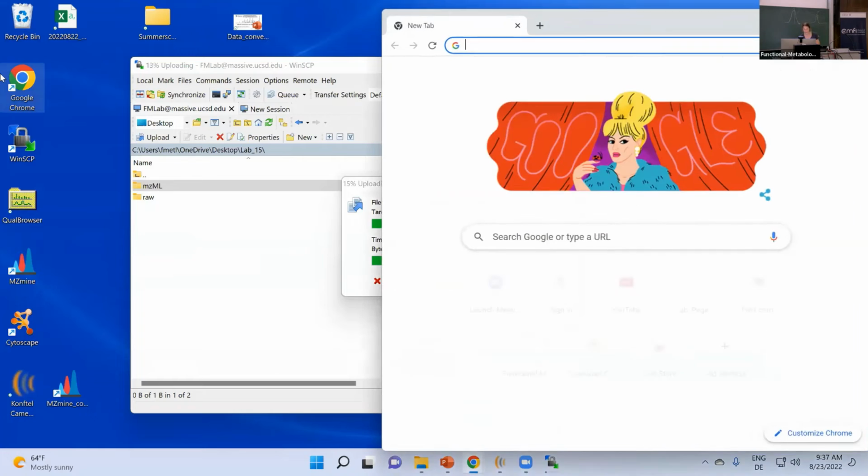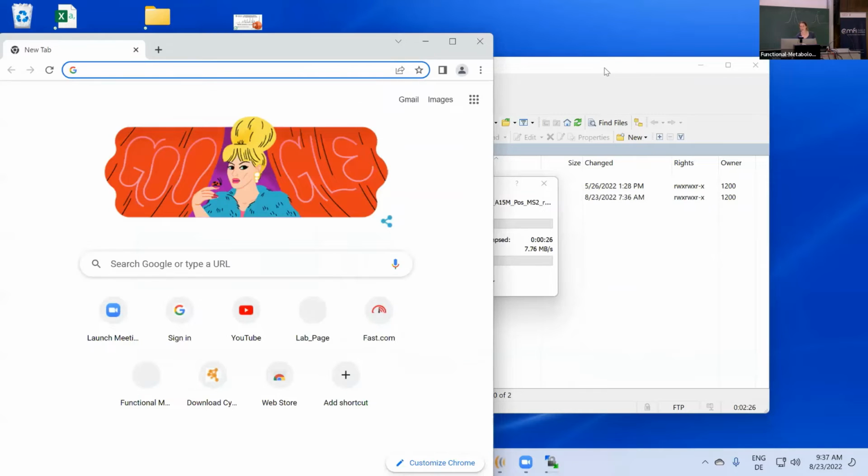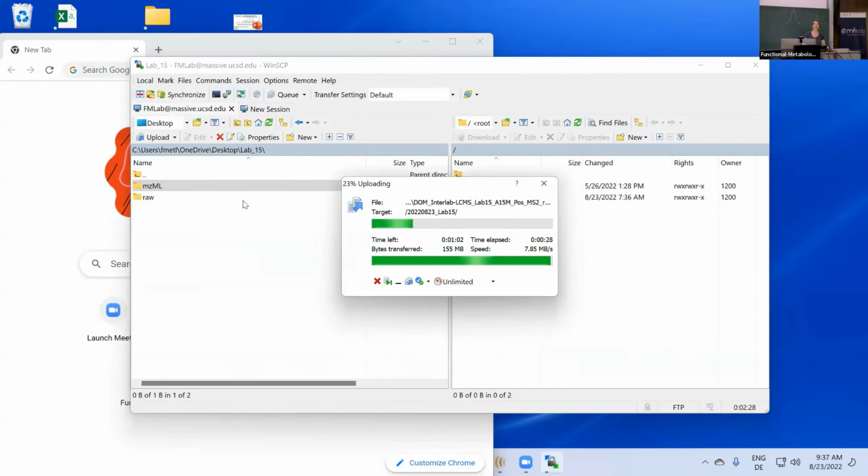Once that's through, oh yeah. Why is it necessary that you also upload the raw data, not only the MZML? Okay, yeah, that's a good question. So it's not necessary to upload the raw data. I personally like to, just in case you had some issue with your file conversion, like maybe you forgot what Daniel was saying and your centroiding has gone wrong. Also, I like having the raw data because maybe something didn't go wrong, but you wanted to reprocess it, then you have it there.